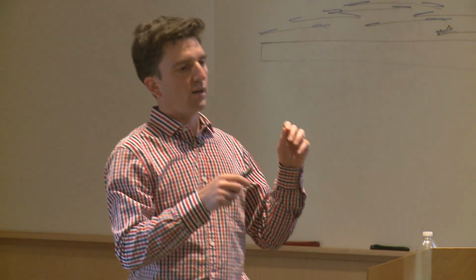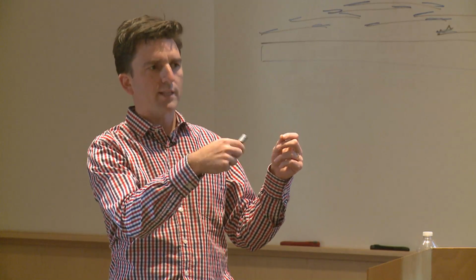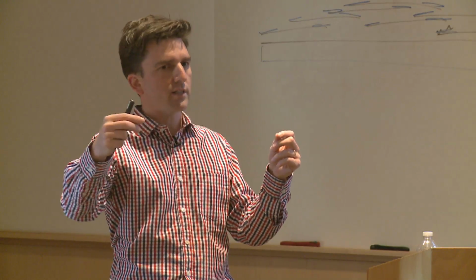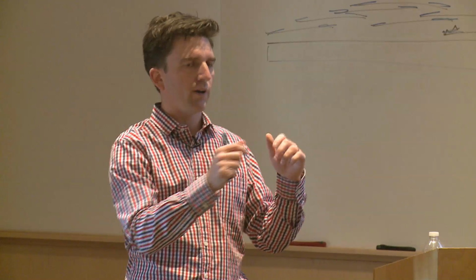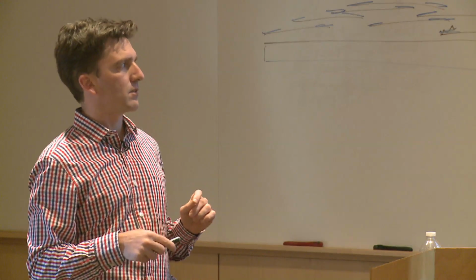So you can specify a complex experimental design with 2 conditions and covariates. And so you can disentangle the covariates and find exactly what's different between the 2 conditions. It's really powerful.